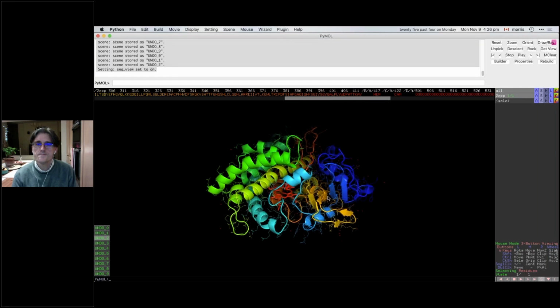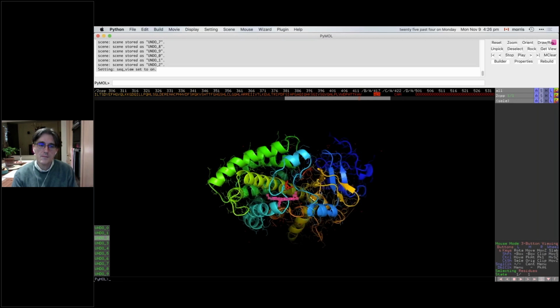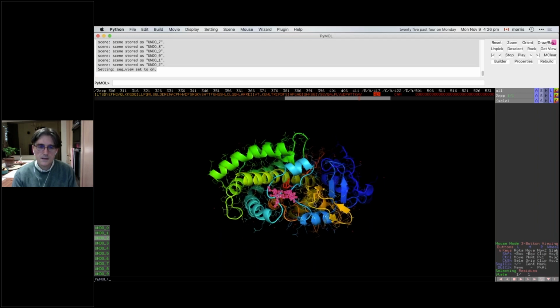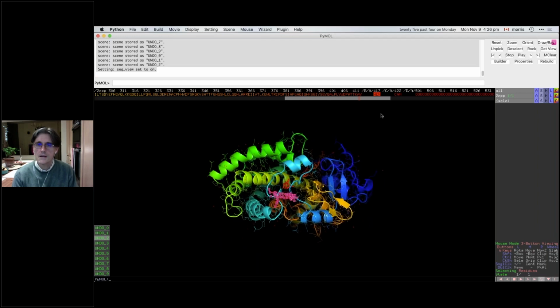the sequence of the protein. In this representation, we're seeing amino acids with single letter codes, and any cofactors or ligands have 3-letter names. So if I click on that, it highlights the heme. One thing that is always useful when you're trying to look at structures is to set the depth queuing appropriately. So if we've got the heme and the cam, say we want to focus on those as being part of the active site. So I've now got a selection.